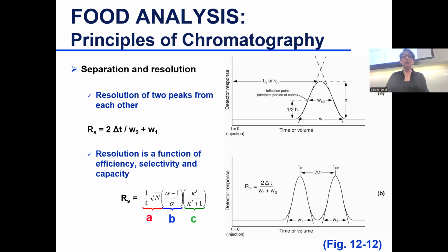Resolution is a function of three things. Now things are going to get a little bit more intense. I'm going to talk about those functions: efficiency, selectivity, and capacity. So I'll explain each one separately, and then everything will come together at the end.